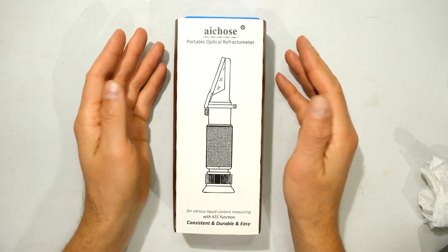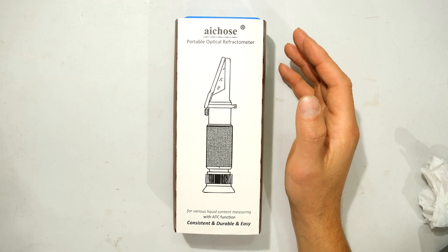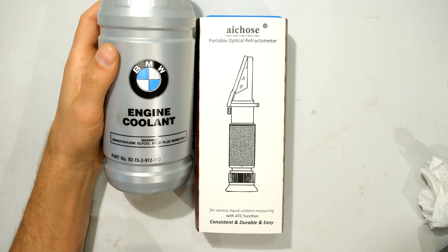In this video I'll be demonstrating how to use a portable optical refractometer. In this particular example, I'm going to be demonstrating how to use it with coolant or antifreeze, and I'm going to show you step by step how to take the measurement.